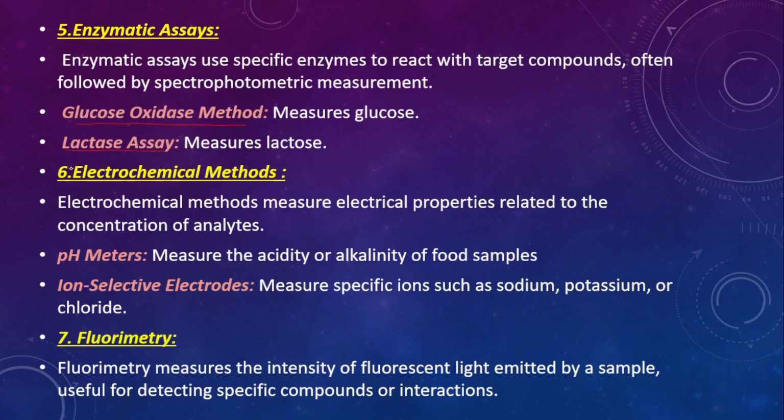This method typically involves incubating lactose with the enzyme and measuring the resulting glucose using glucose assays or spectrophotometric methods. It helps monitor enzyme efficiency and optimize production conditions. Lactase assays are essential for quality control in producing lactose-free milk, cheese and other dairy products. The lactase assay is used to measure lactose.